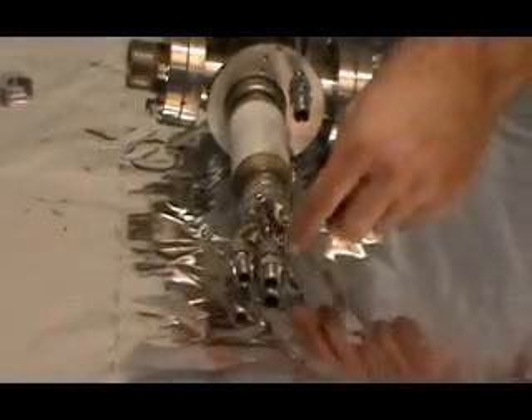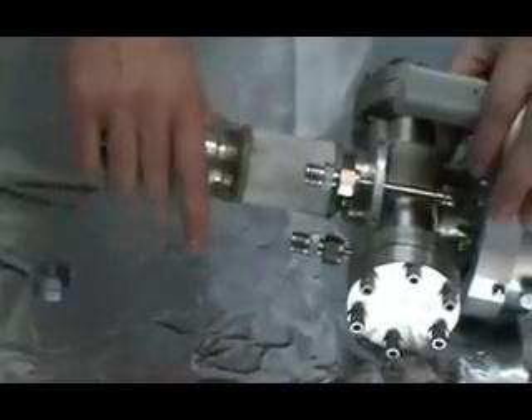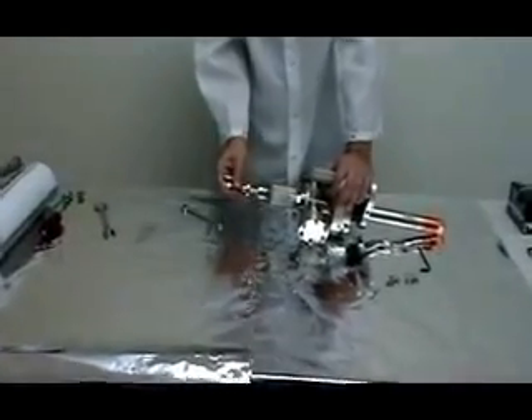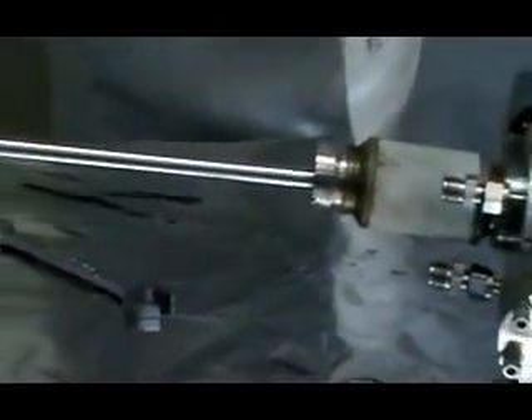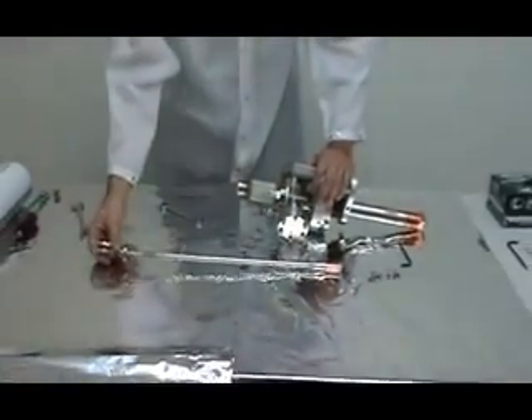Here we can see the cap head screws that hold the anode in place — on some anodes those are Allen heads, on some they're spline. Remove the screws by turning them counterclockwise. Carefully slide the anode out; you may have to work it back and forth. Do not touch the vacuum end of the anode with your bare hands. Carefully work it out past the end of the source — we don't want to damage the anode by scraping it — and then carefully set it down on the table.